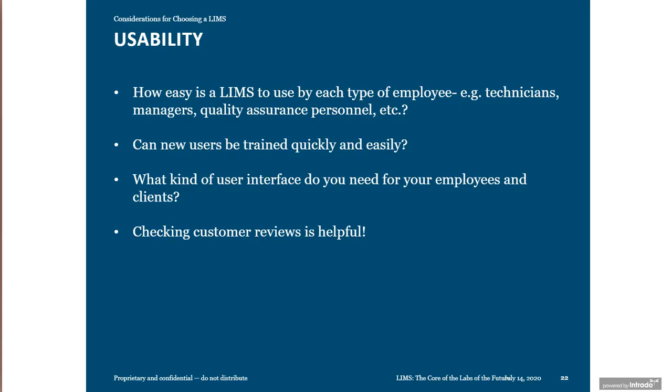Usability. This is another important consideration, because at the end, end users need to be able to reap the benefits of a LIMS system, not to work for the system, but rather the system work for them. So how easy is the LIMS to use? And can I segregate what my different types of users can see based on their roles and responsibilities?